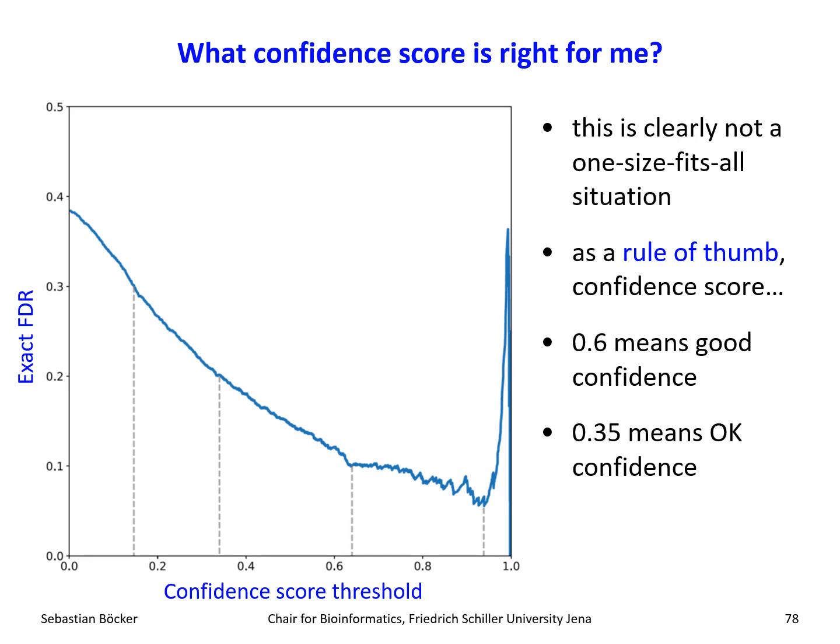Confidence scores above 0.6 definitely mean it's a high quality annotation. It has an FDR we don't know, maybe 10%, maybe 20%, maybe 5%. You can never be sure. That depends on your data set, but at least it's a reasonable, good annotation, and you should rather think that it's correct than that it has a 50-50% chance. 0.35 already means okay confidence.